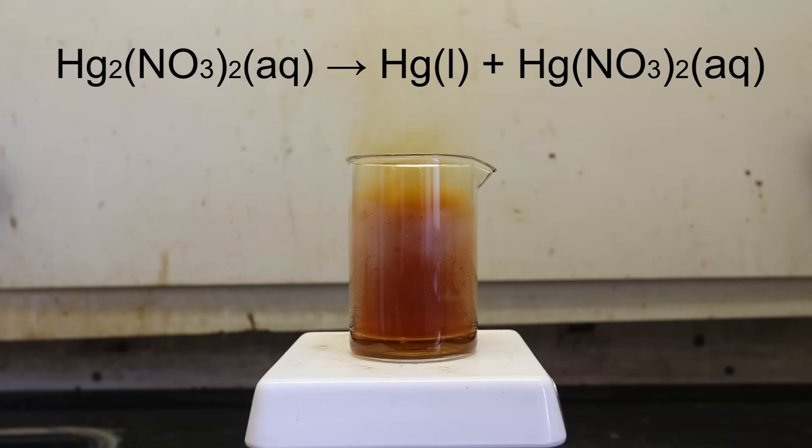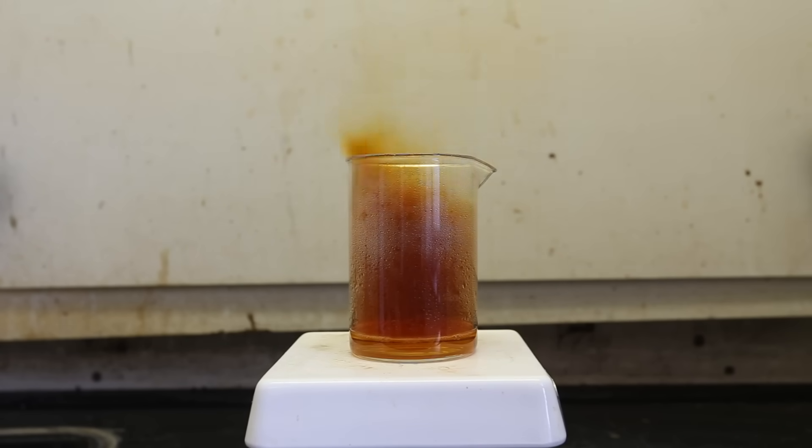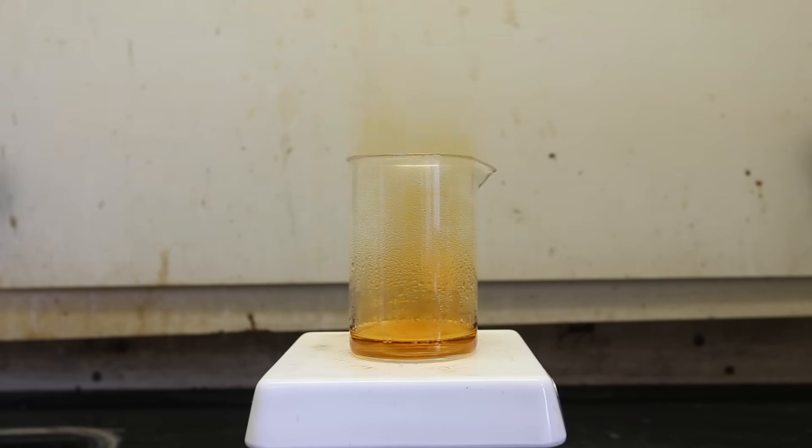The mercury(II) nitrate dissolves into solution, and the elemental mercury reacts with the concentrated, high-temperature nitric acid to again form mercury(II) nitrate. The solution is boiled until red gas is no longer released and instead white gas is released. You can also see that the solution clears from a dirty green color to a fairly light yellow color, signifying that the majority of the nitrogen dioxide gas has been released.